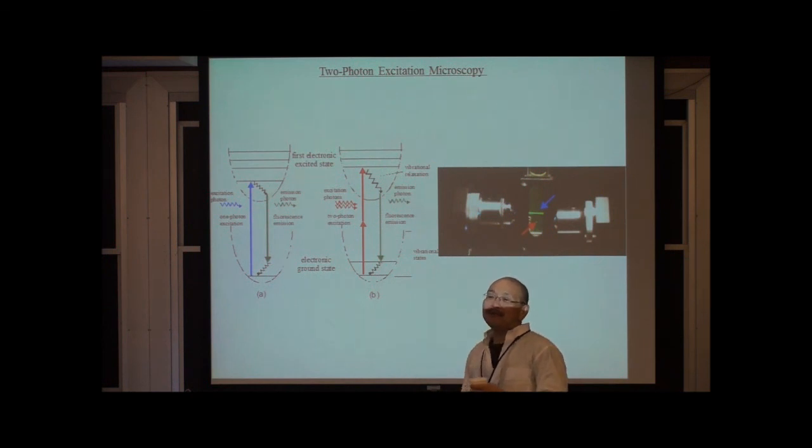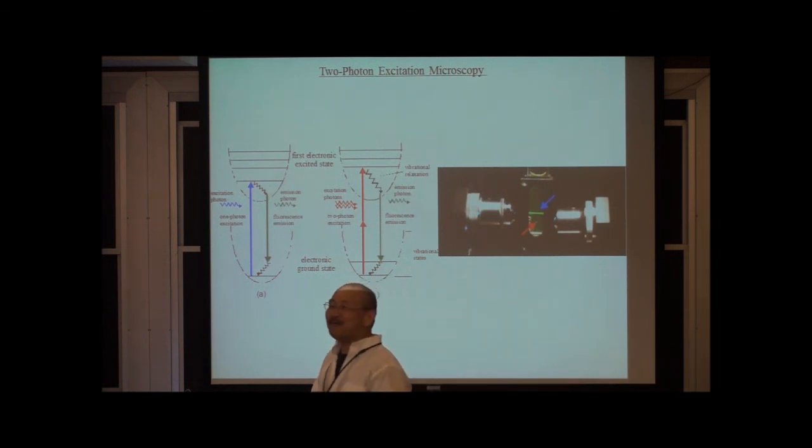But if you want to do multiphoton microscopy like in my lab, you would be spending about maybe a couple hundred thousand dollars to buy a titanium sapphire laser that generates a light spot and would generate femtosecond pulses, that I will explain in a little bit.